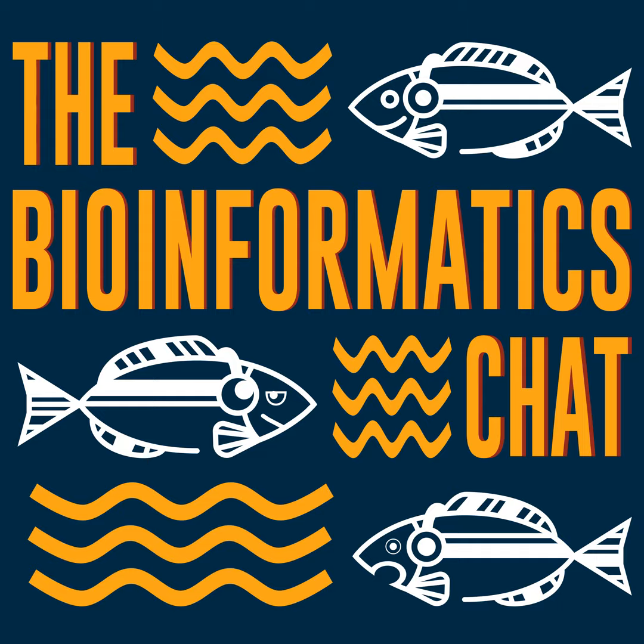So just a recap for those who may not be quite as familiar with nanopore sequencing, what will happen is that a DNA strand flows through a nanoscale pore in a membrane, and as it's flowing through, ionic current is being run across. And so as the DNA sequence unwinds and goes through the pore, the signal that comes out the other side that's being measured changes depending on what DNA is in there. And so we can modify the DNA sequences to produce signals from the nanopore sequencing machine that look different. And that is our goal in this case.